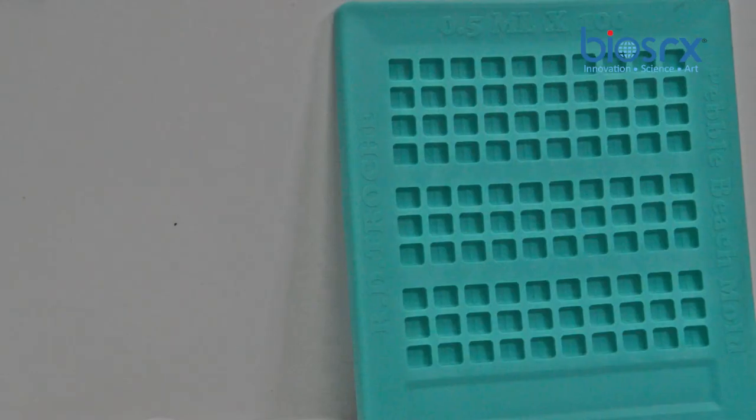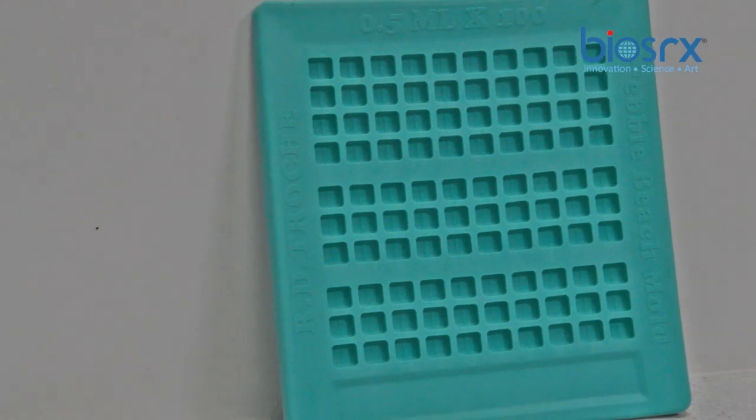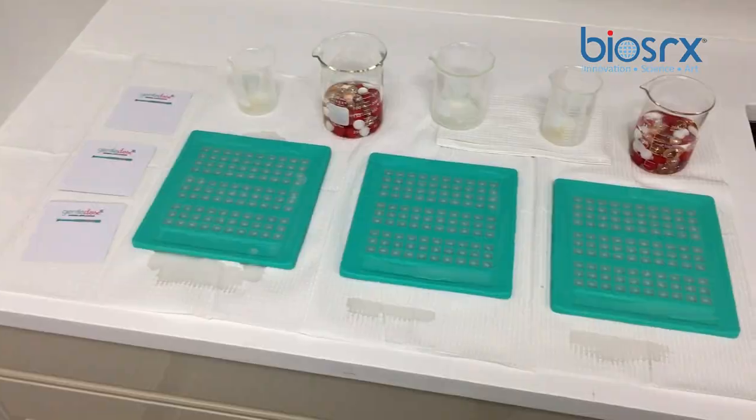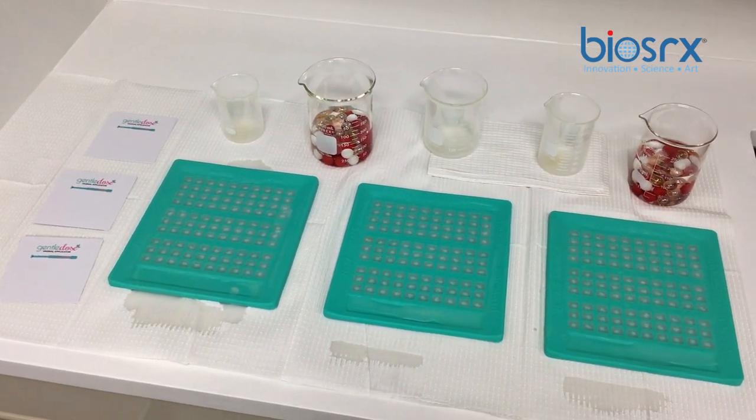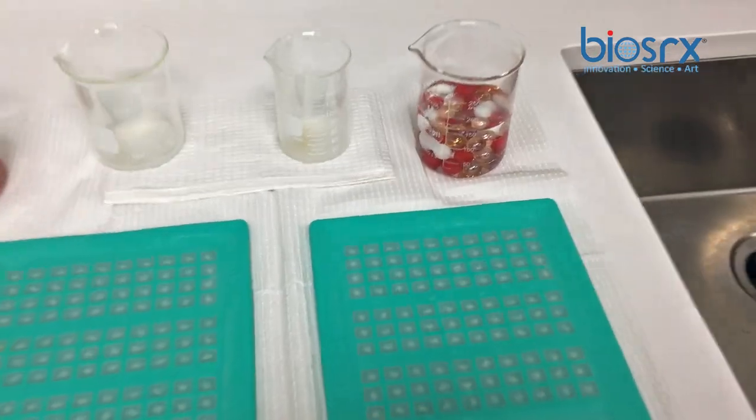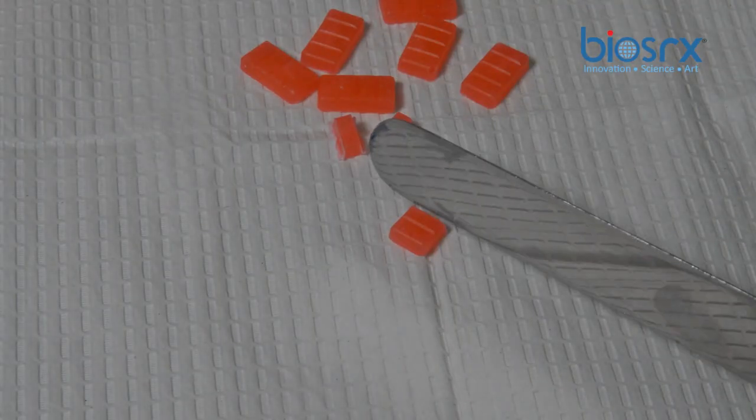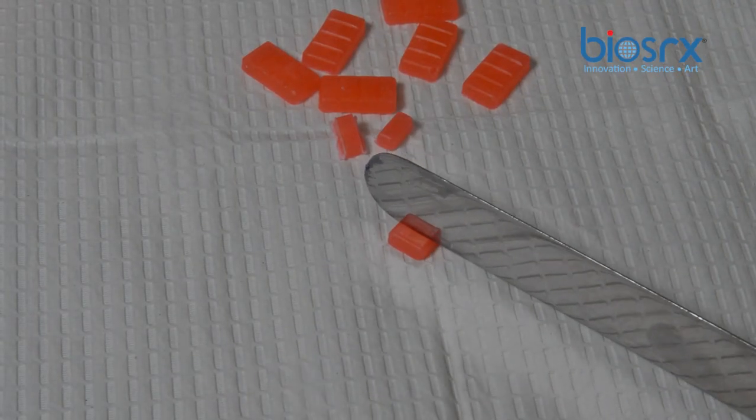RD trochee molds come in two cavity sizes. The half-milliliter mold can hold approximately 120 milligrams of active pharmaceutical ingredients, such as sildenafil, tadalafil, and testosterone. These molds are single-scored that allow the trochees to be cut in half.